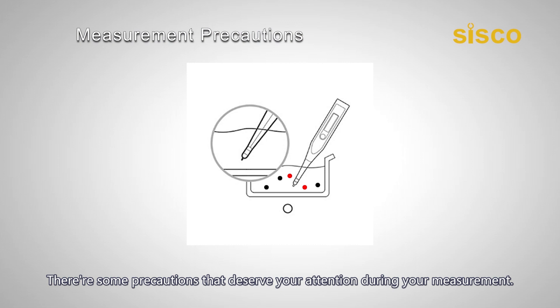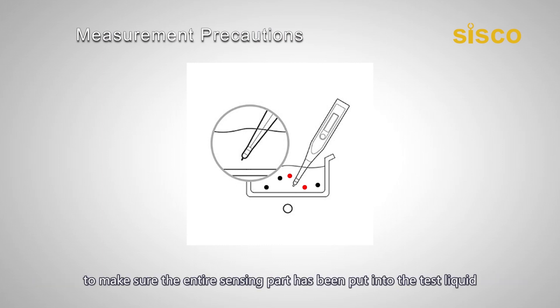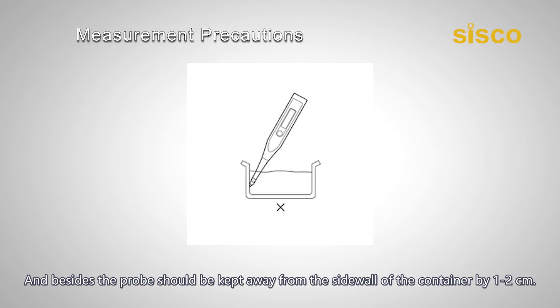There are some precautions that deserve your attention during measurement. The sensor probe should be dipped in the sample to the required level to make sure the entire sensing part has been put into the test liquid. The saline water also needs to be deep enough to fully submerge the probe. If there is some residue floating in the liquid, make sure the probe does not touch it when measuring. Besides, the probe should be kept away from the sidewall of the container by 1–2 cm.